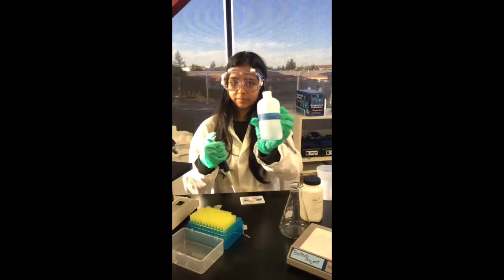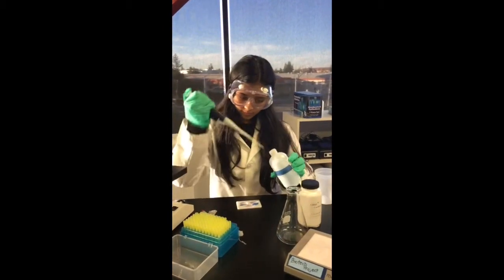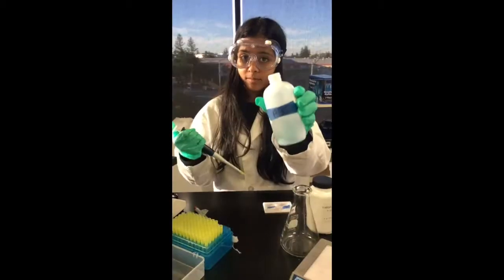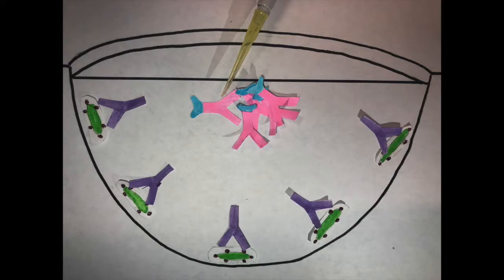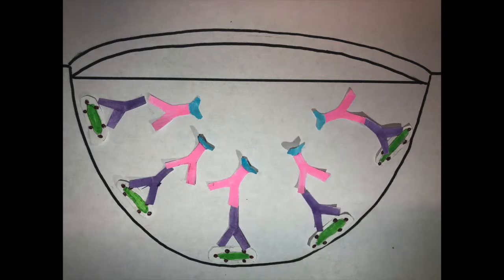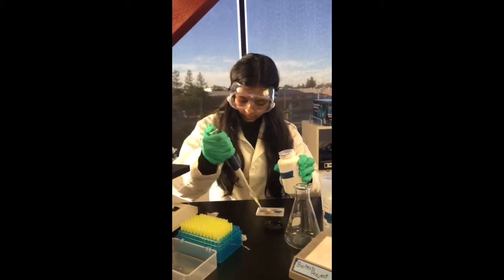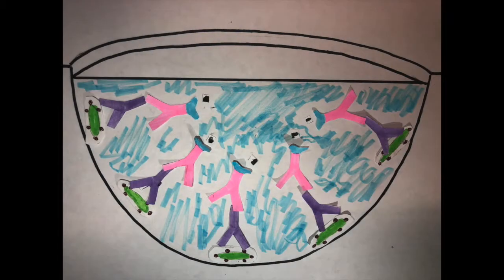Back to work. Now I have to add 100 microliters of the secondary antibody to each of the wells, incubate for 15 minutes at 37 degrees Celsius, and wash with PBS buffer. These enzyme-linked antibodies are capable of reacting with the constant region of other antibodies, so if the antibodies have bound, then these secondary antibodies will bind to them. Now I add 100 microliters of colorless substrate solution to each well, which is designed to bind the enzyme-linked antibodies when incubated at 37 degrees Celsius for 5 minutes. If the dye molecules are activated and there is the development of color in the well, then that indicates the presence of my antibody. Yes.